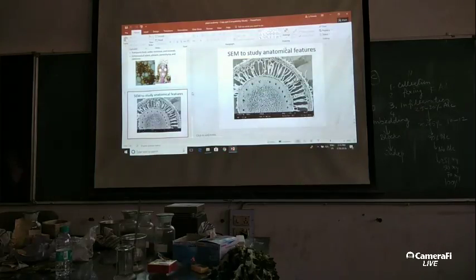ये एक पूरा channel है, cylindrical structure है. So naturally ये channel complete जाएगा नीचे तक, and you can just see here. If you see carefully, all these metaxylem are also showing a thickness, a depth दिखाई दे रही है, because it's a scanning electron micrograph. So all these, if you add to your paper, they become too much, and everybody would say, okay, you are able to decipher it, and if you cut a hand cut section, put it on it, the same plant, same magnification, they will superimpose with each other and your parameters are all true.